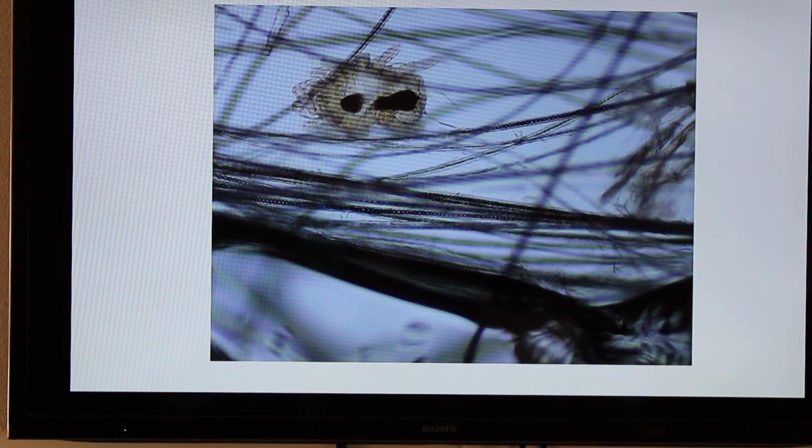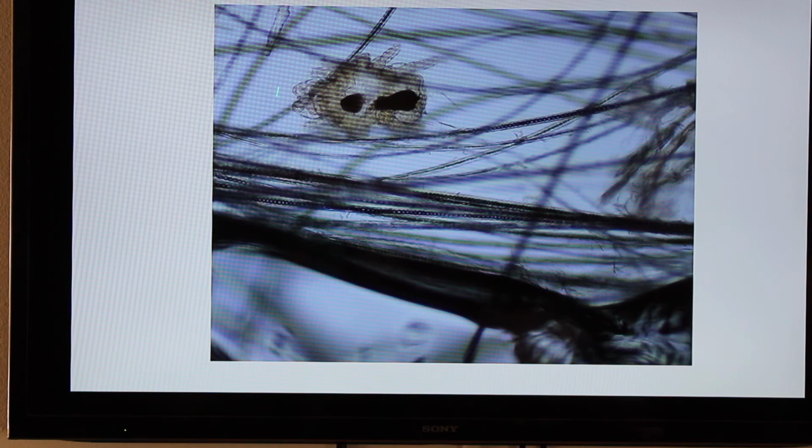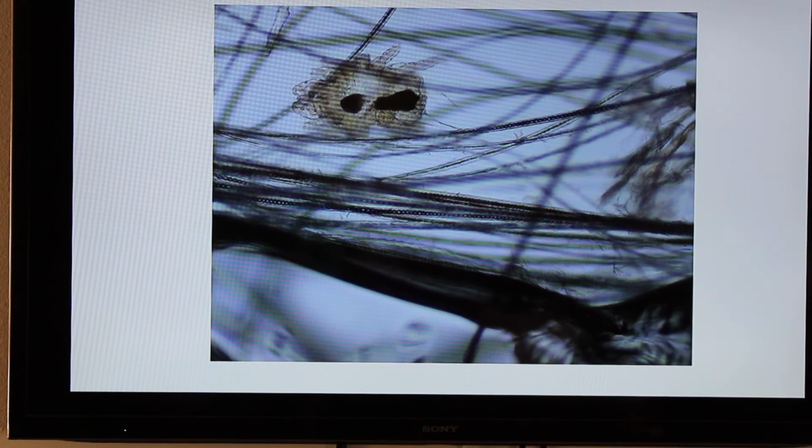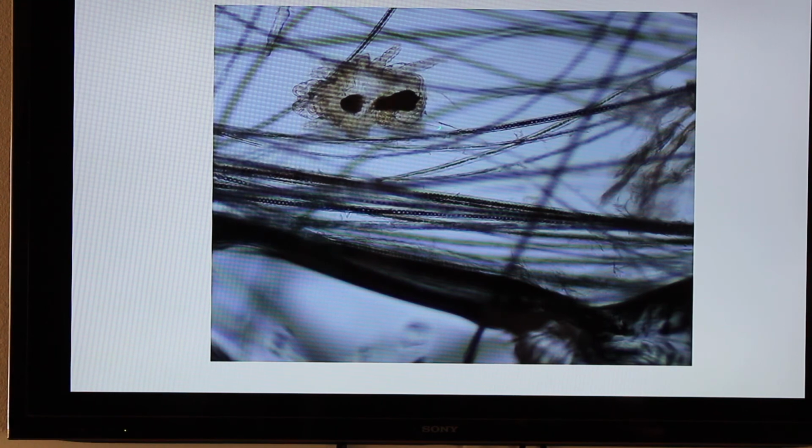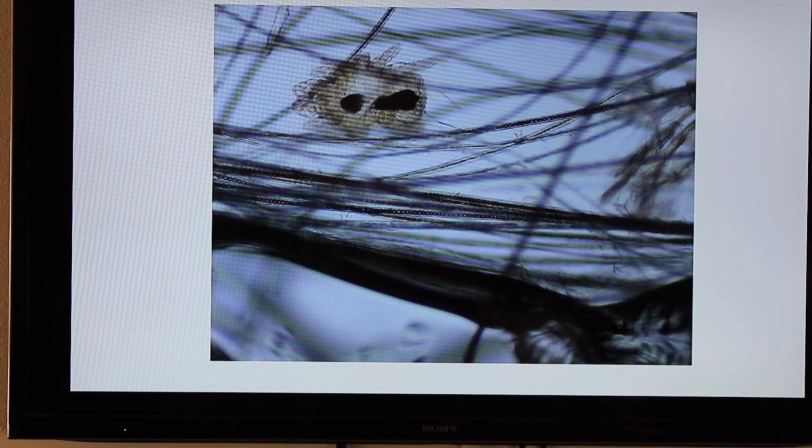They're identified also by their really unique mouth part. And I don't know, for some reason that exclamation point always stood out to me. Cheyletiella!